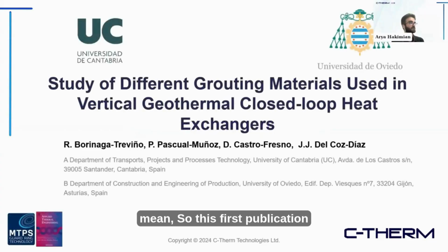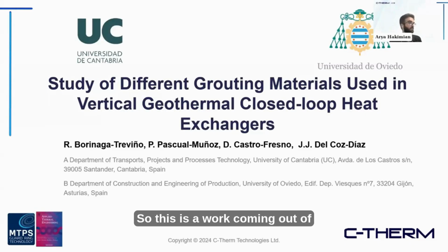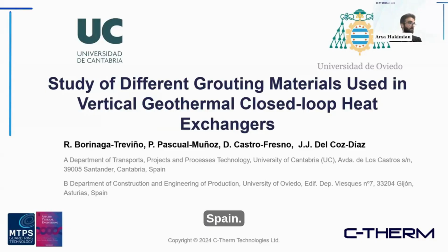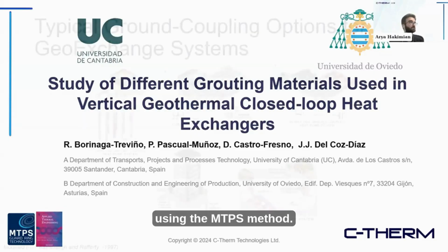So this first publication is called The Study of Different Grouting Materials Used in Vertical Geothermal Closed Loop Heat Exchangers. So this is some work coming out of Spain. This was published in the Applied Thermal Engineering journal there, using the MTPS method.